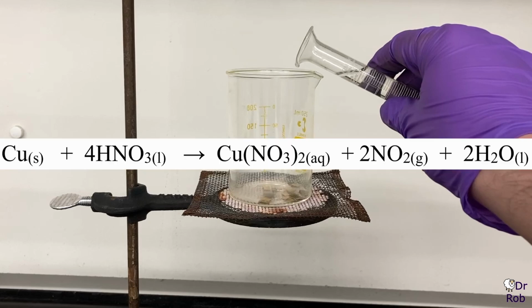If we look at the reaction that we're going to be seeing, I'll put it up on the screen here, we have copper reacting with the nitric acid to produce copper nitrate, NO2 gas, which I mentioned, the nitrogen dioxide, and some liquid water.